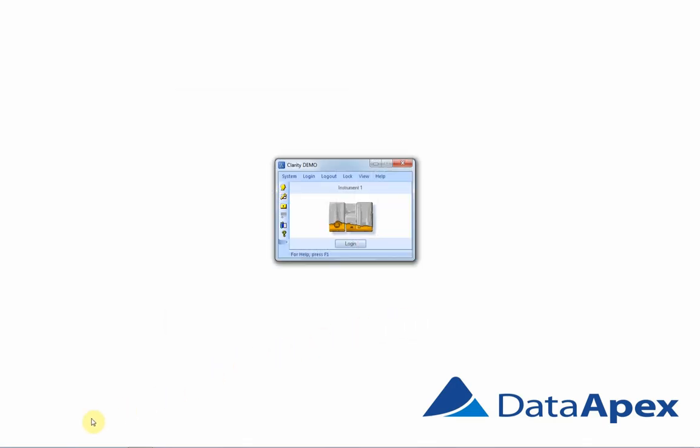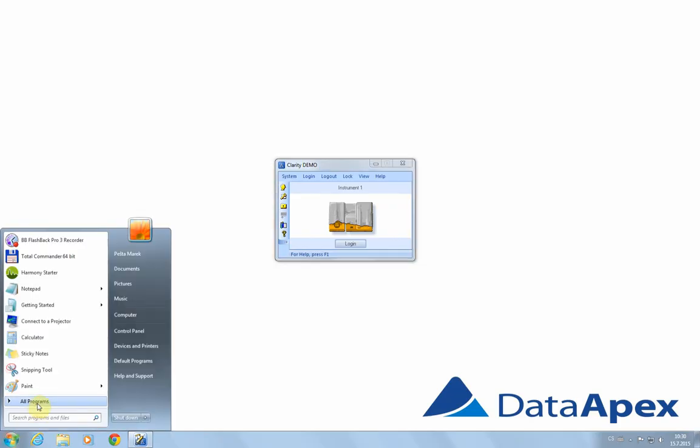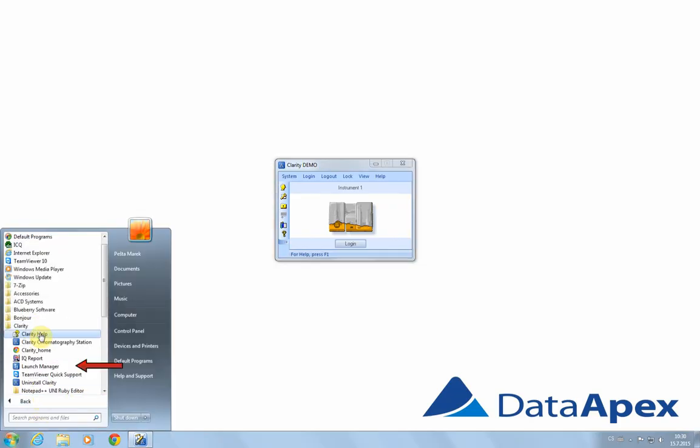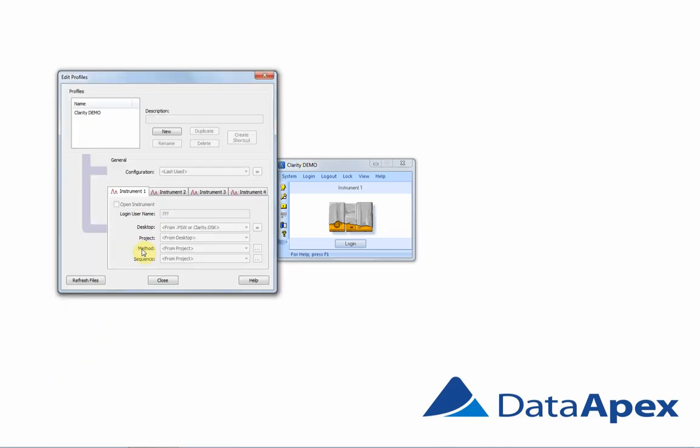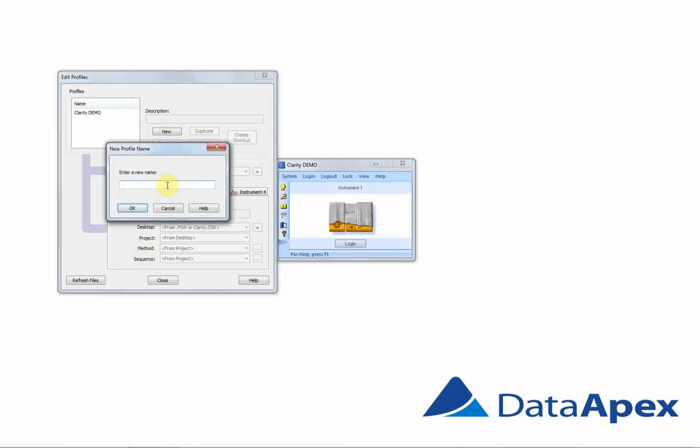Launch Manager is located in the Clarity group under All Programs. To create a new profile, click on the Edit Profiles. The first profile will be using both detectors. Therefore, I will name it FLD plus DAD and click OK.